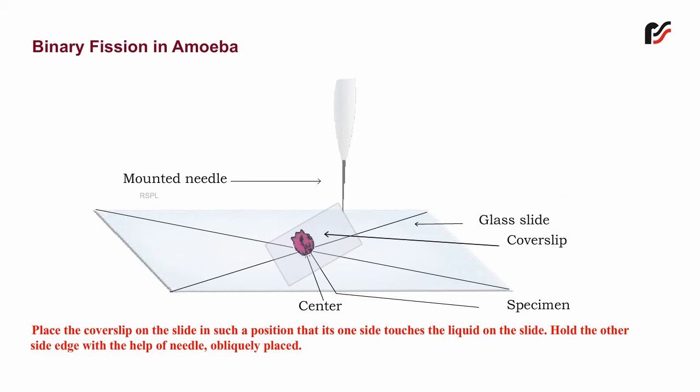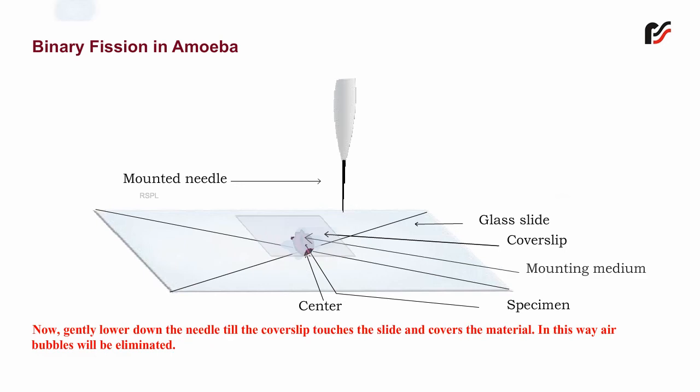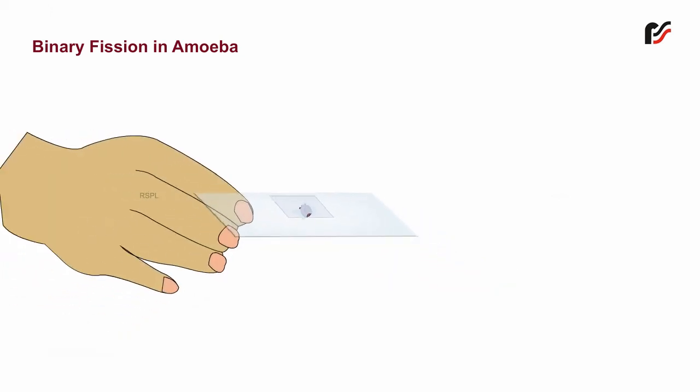Hold the other side edge with the help of a needle obliquely placed. Now gently lower the needle till the cover slip touches the slide and covers the material. In this way, air bubbles will be eliminated. In this way, the slide of Binary Fission in Amoeba is prepared.